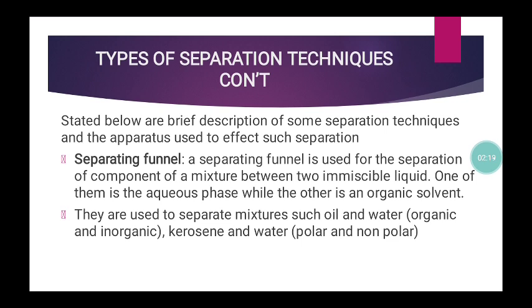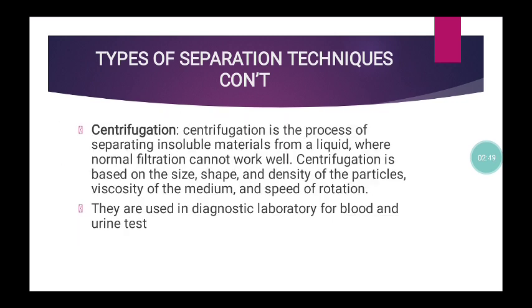A separating funnel is a funnel used for separation of components that are immiscible. By immiscible, I mean that the components cannot mix. One might be in an aqueous phase while the other is an organic phase, so they are not miscible. Examples of such mixtures are oil and water, kerosene and water, that is, organic and inorganic, or polar and non-polar mixtures. Separating funnels are normally used in separating such mixtures.